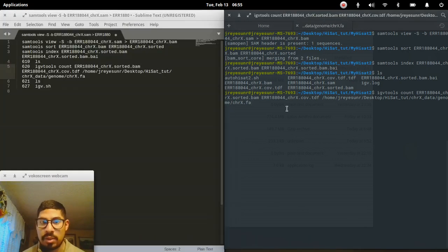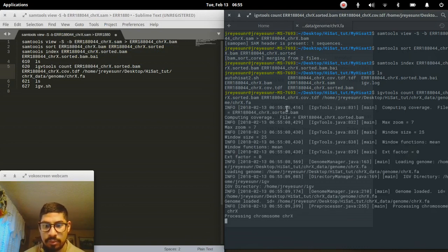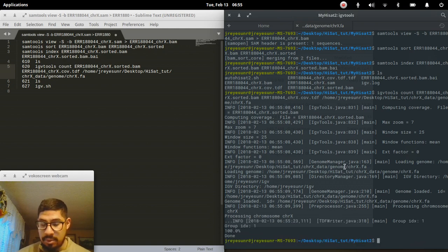So now it's running, processing, called IGVtools over here. It's thinking. I don't know how fast on average most are, but there we go. So now that we have everything done, what I did at that point was I called the shell so I can get the GUI.